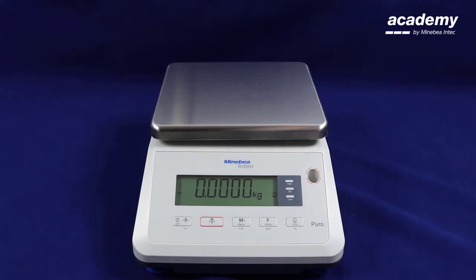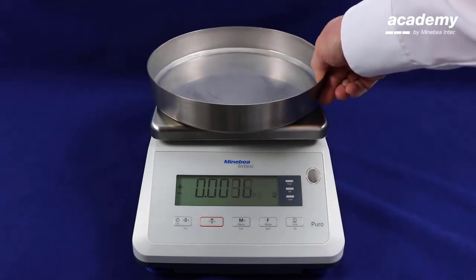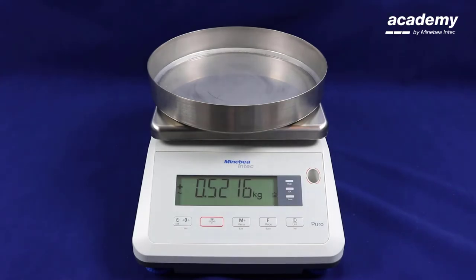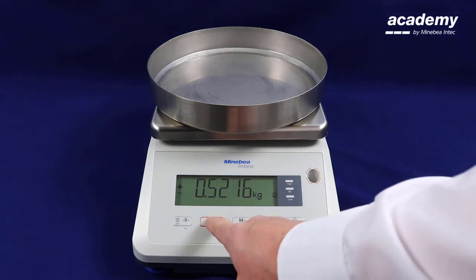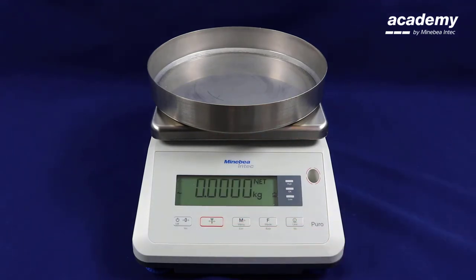This can also be used with the tear function. Put your container on the scale. Press the function key to unlock the scale, and now you can use the tear key. Now you can put your samples into the container.